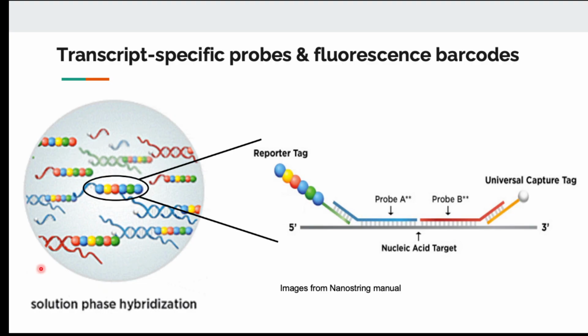So what Nanostring people decided is that, for protein we have antibody pull down, right? So in this case, because it's nucleotide, we can target nucleotide with probes, complementary probes. But if we target the nucleotide with just complementary probes, then we cannot see, right?